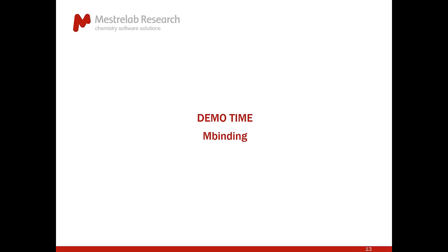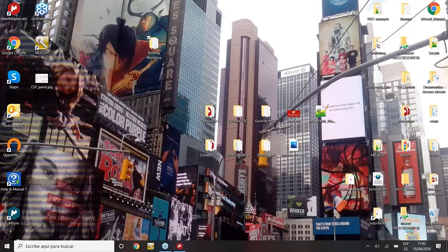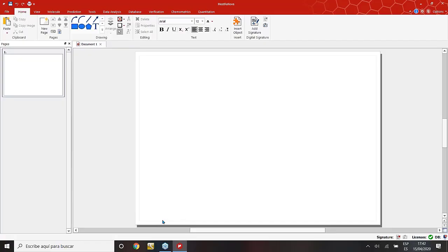But of course, we don't want to see this in PowerPoint. I think it's a lot more fun and interesting to see it in the software itself. So I'm going to give the stage to Pablo now, and he can show us how this works in the software. Now, the objective is that you guys can, by using the materials that you were sent with your registration email for the webinar, follow this and try to do the same as Pablo does, and hopefully by doing so, you can achieve similar results with the sample data that we sent you. Pablo, all yours.